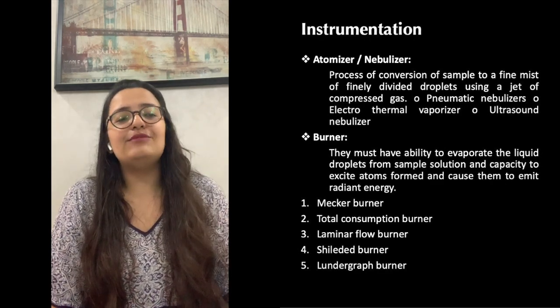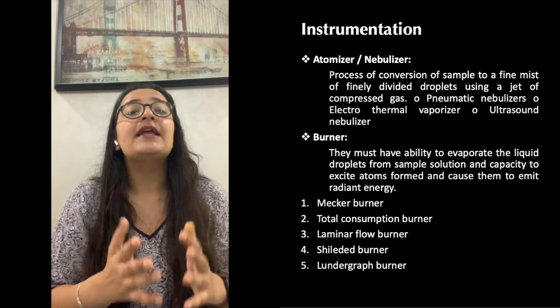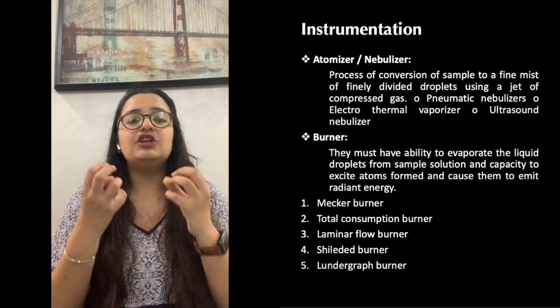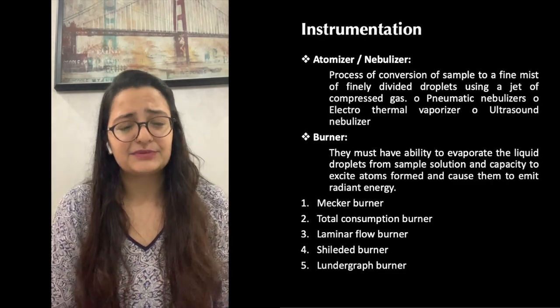These are the various types of nebulizer: pneumatic nebulizers, electrothermal vaporizers, and ultrasonic nebulizers.